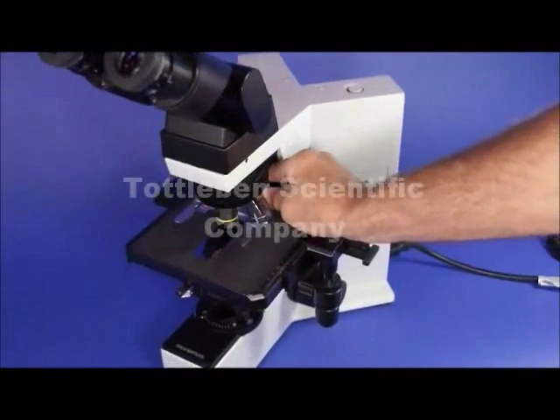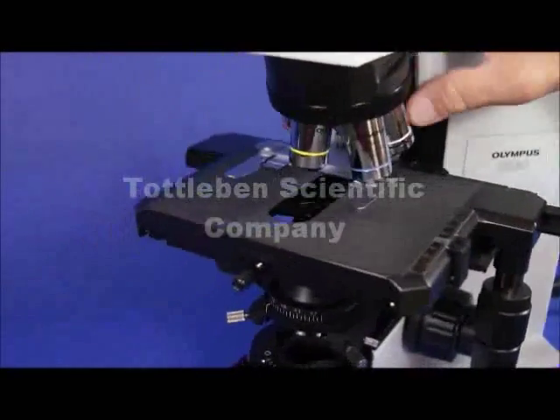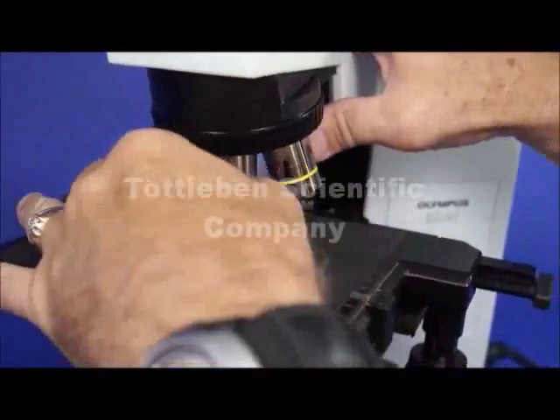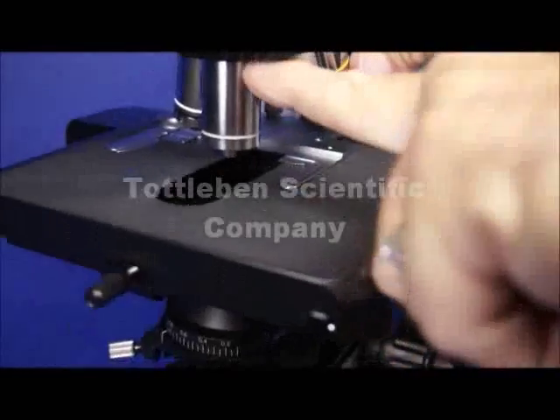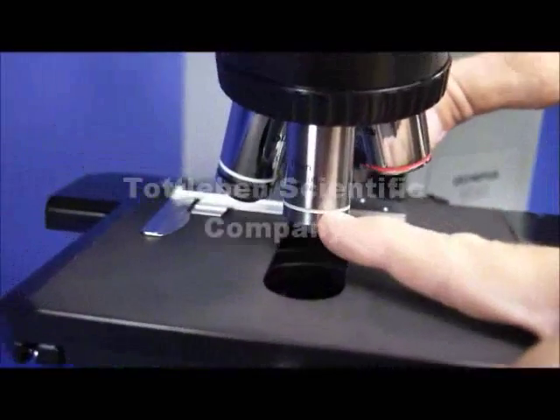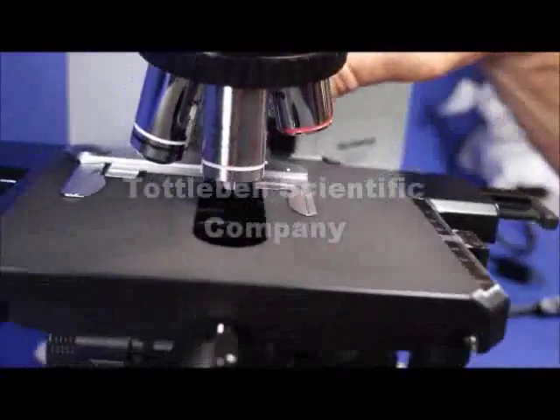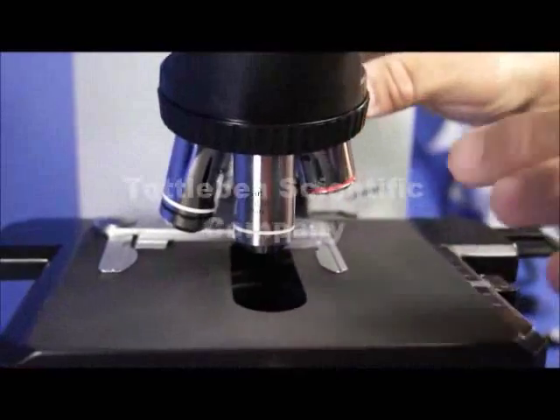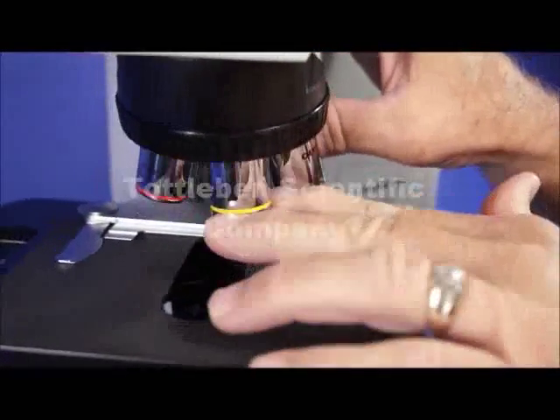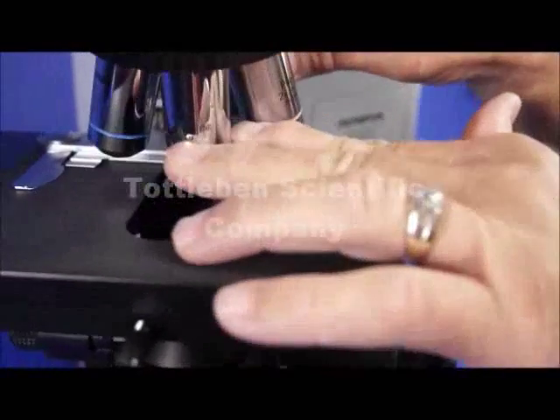Working our way down to the five-place nosepiece, we have a set of Olympus Plan Akromat lenses. It starts off with a 2x, which is one of the longest lenses on the nosepiece — a very, very wide field. This would be an ideal microscope for a pathologist or a cytologist. And then you have a 4x, 10x, 40x, and a 100x.